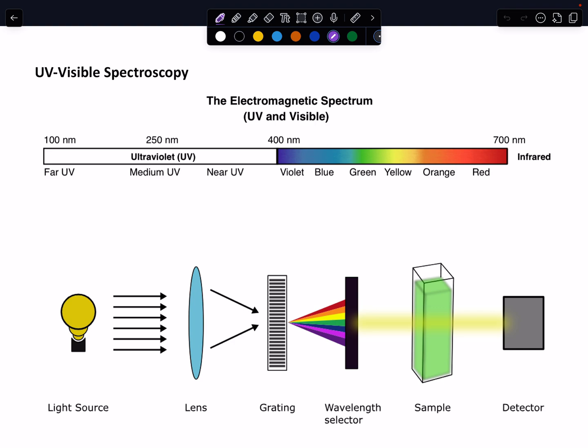This screencast is going to focus on the spectroscopic technique that utilizes UV visible radiation, also known as UV-Vis spectroscopy. If you have questions about general spectroscopy or IR, mass spec, or PES spectroscopy, please look at those individual screencasts. This one will focus just on UV-Vis.